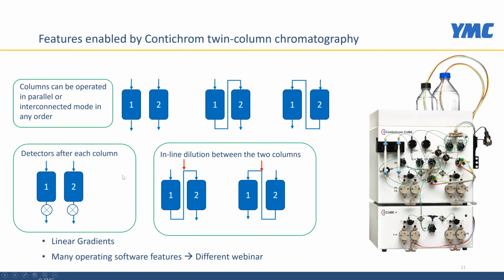This just shows an expanded zoom of the previous first step of the MCSGP wizard, and shows also how you can enter purity data by importing the data from Excel and pasting them into this table. So it's really straightforward to move from single column chromatography to the MCSGP method. The drag and drop will allow you to select the regions for internal recycling and product extraction. So this is also done very user-friendly on the first page of the wizard.